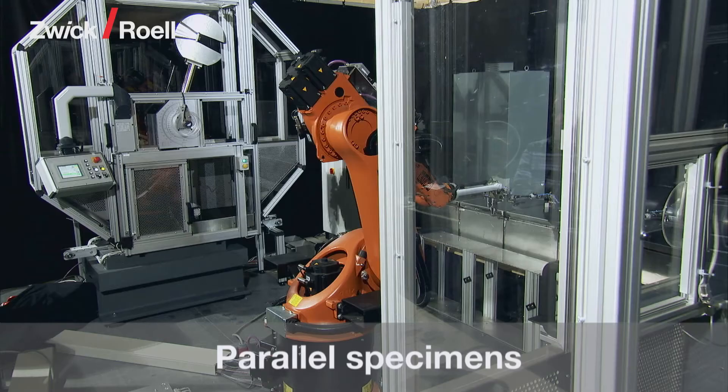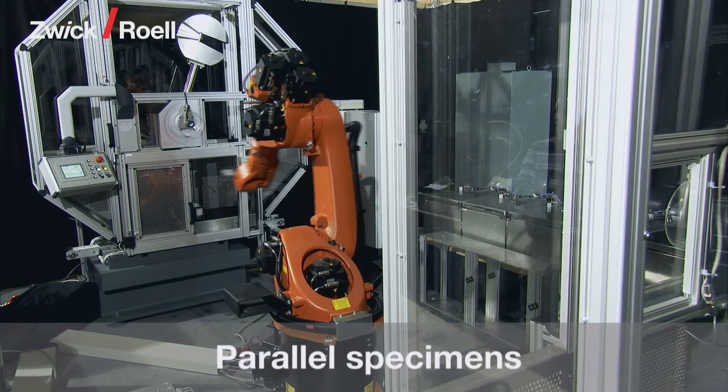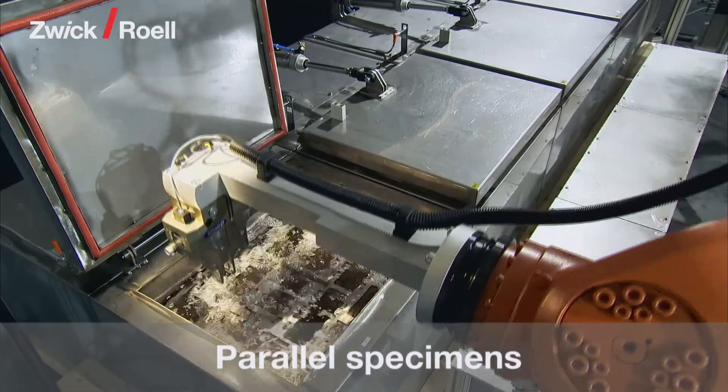Up to 30 magazines can run in parallel within the system. The optimized parallel processing ensures a high specimen throughput.